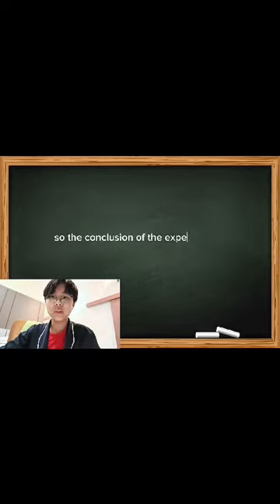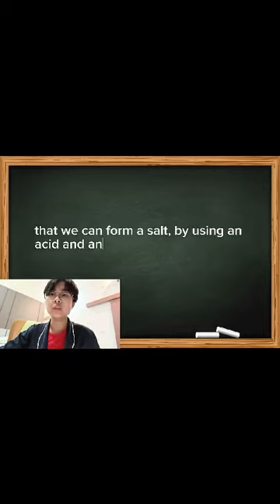So, the conclusion of the experiment is that we can form a salt by using an acid and an insoluble base.